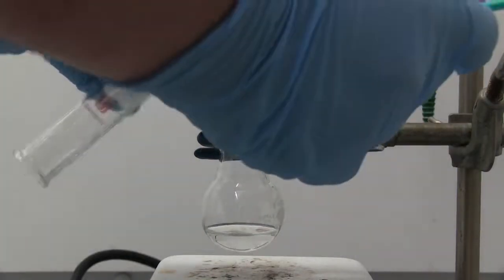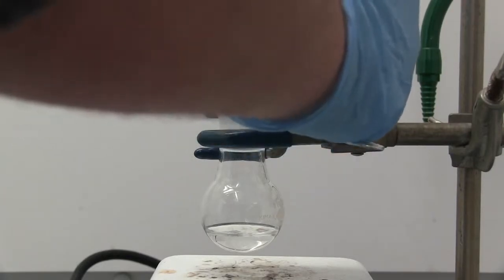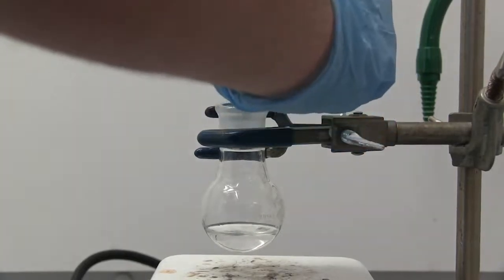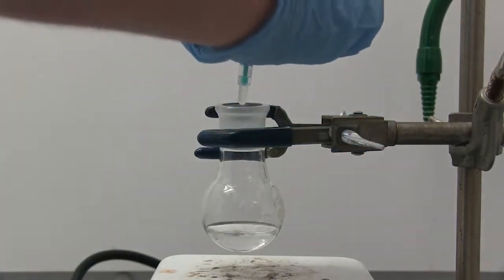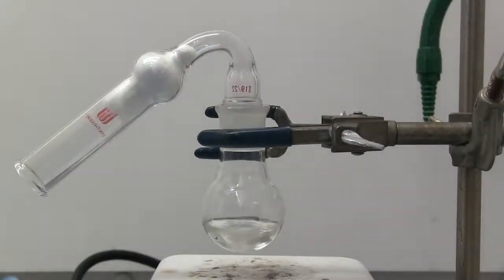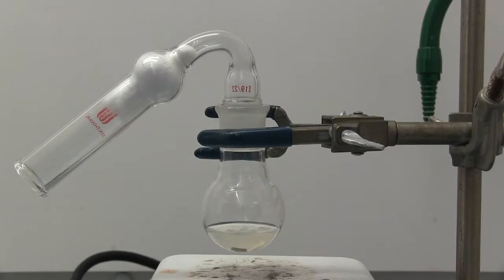So now we're going to add, drop-wise, our methyl iodide. And we should see a reaction begin to form. Make sure you add your drying tube and we'll get a stir rod in there. All right, I am beginning to see a little bit of bubbling and a little bit of cloudiness in the solution. So we're going to let this run for a little bit and try and let it fully react.